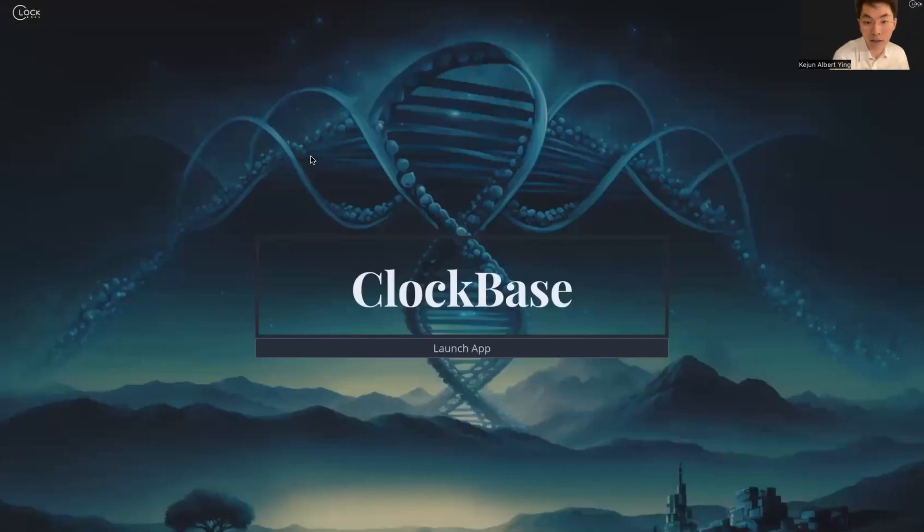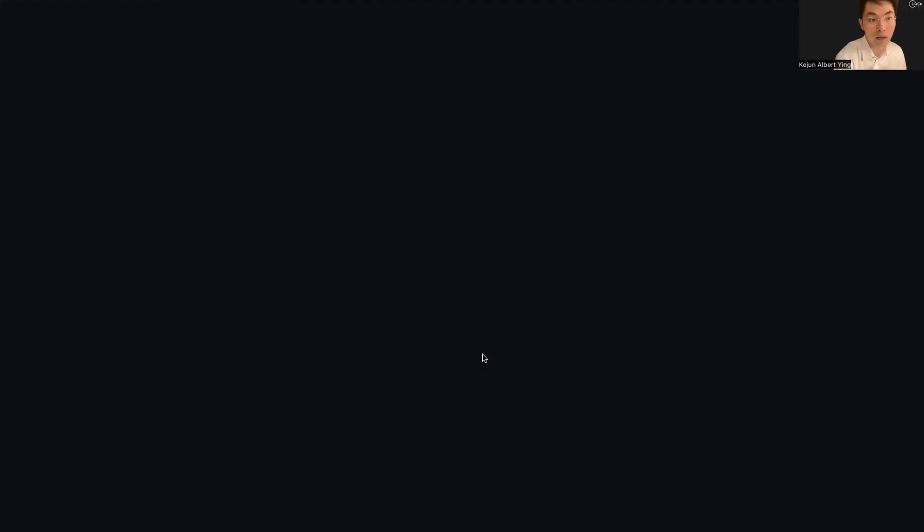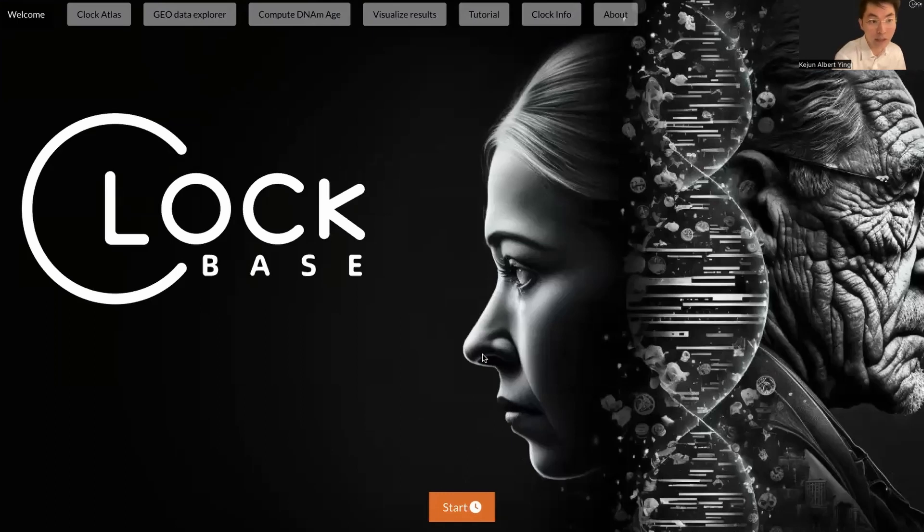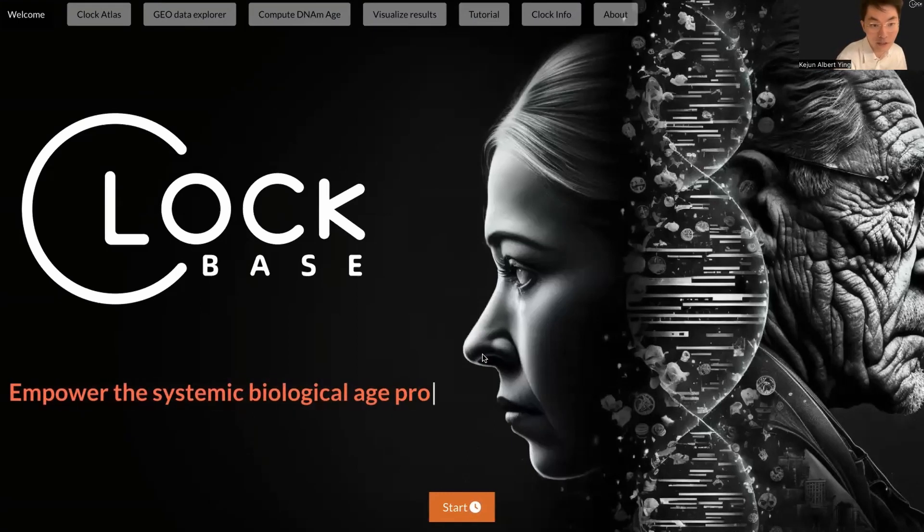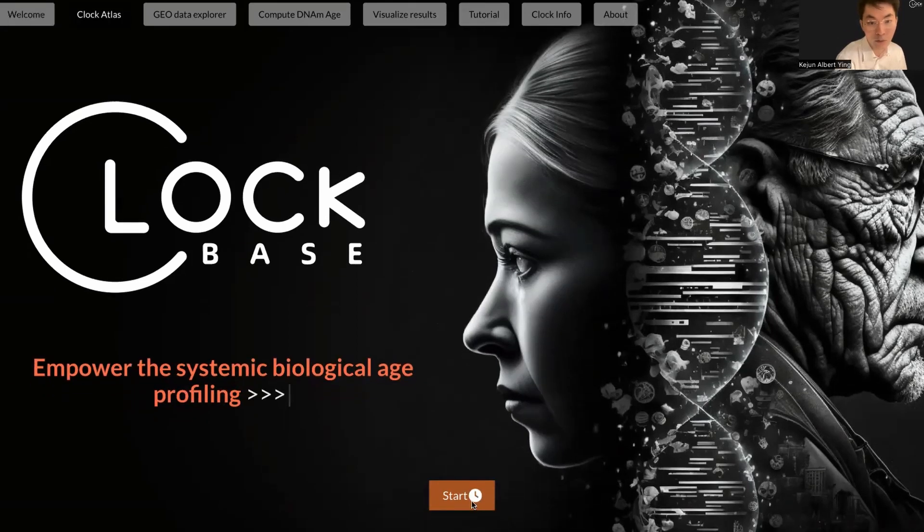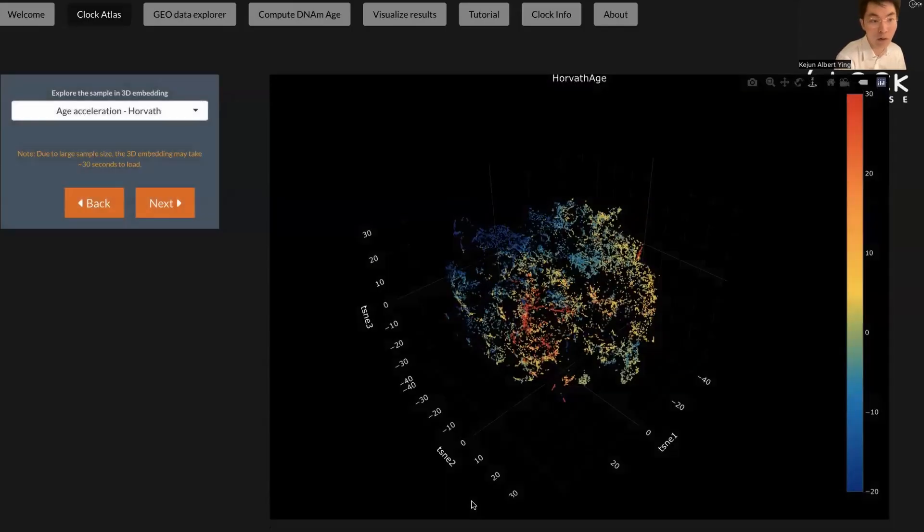Here we're at the homepage of the ClockBase website. You can click Launch App to get into ClockBase. We need a few seconds to initiate the program. After that, you can click Start. It will lead you to the first page of our website, which is the ClockAtlas.